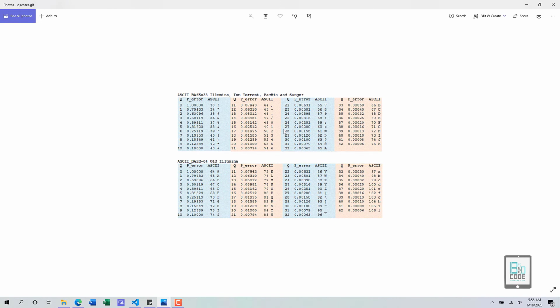Basically, there are Phred 33 ASCII characters, and each character utilized within the FastQ format has its own particular score. This score is read by FastQ interpreting software that can understand that these regions are lacking accurate information, and these have some good information, based on the quality score associated with each nucleotide region. Each region has its own ASCII character, and that defines its quality.